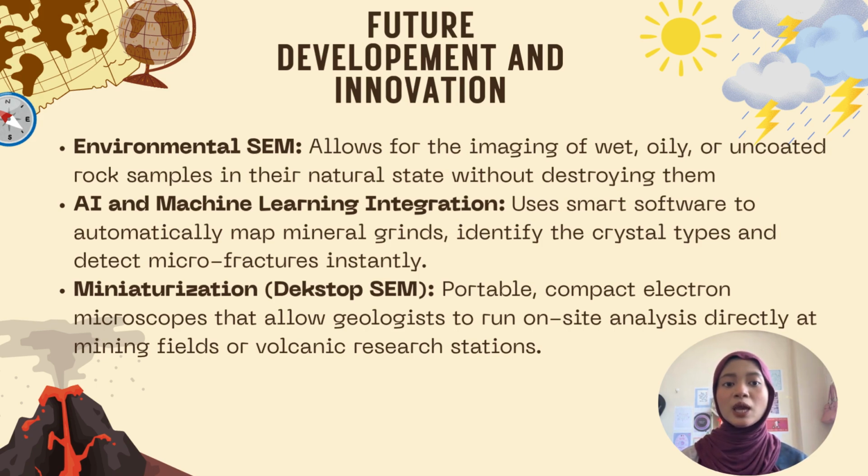Finally, we are seeing miniaturization through desktop SEM. Electron microscopes are shifting from room-sized installations into portable compact desktop units. This allows geologists to run high technology on site, analyzing directly out in the mining field or at active volcanic research stations.